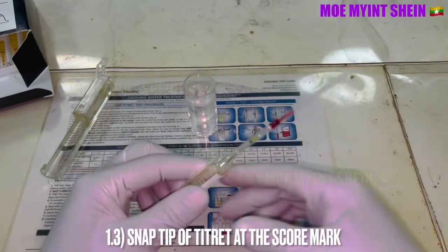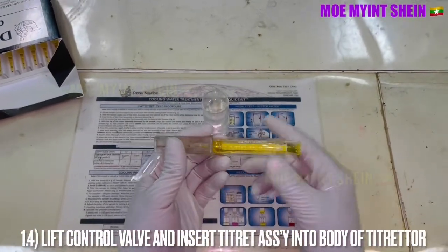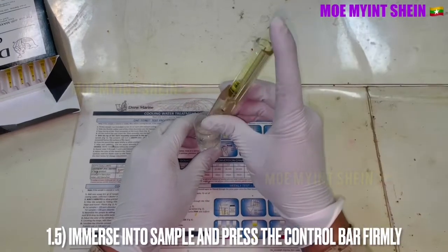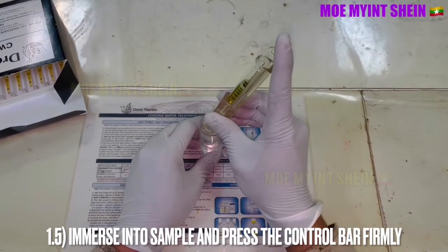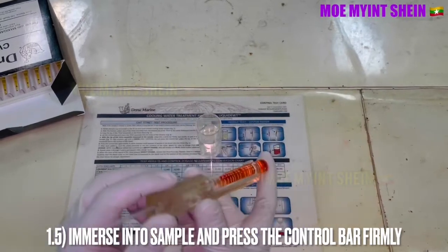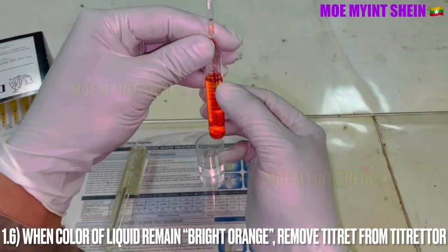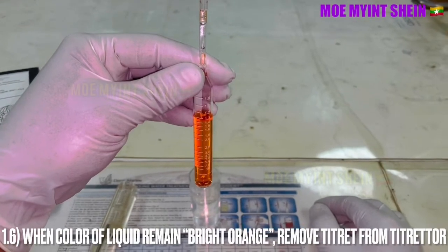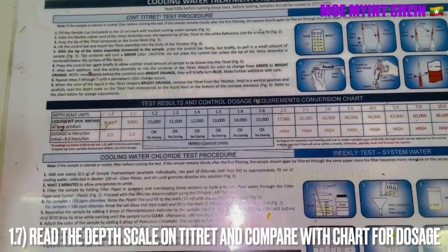Snap the tip of the Titret at the score mark. Lift the control bar and insert the Titret assembly into the body of the Titrettor. Then immerse into the sample and press the control bar firmly. Remove the Titret from the Titrettor when the color of the liquid remains bright orange. Read the depth scale on the Titret and compare with the chart for dosage.